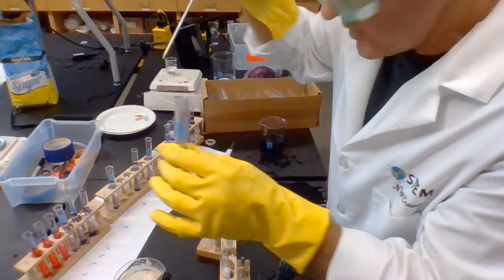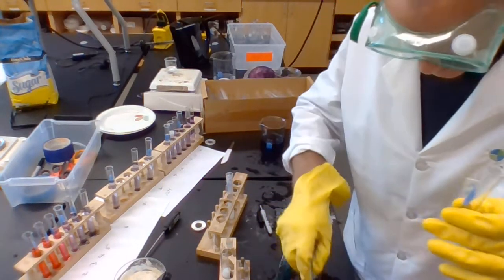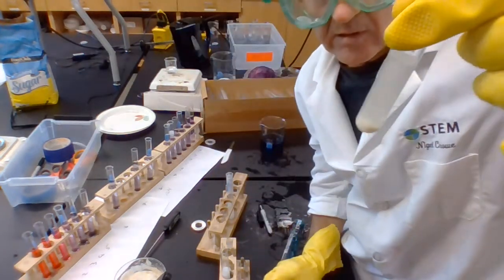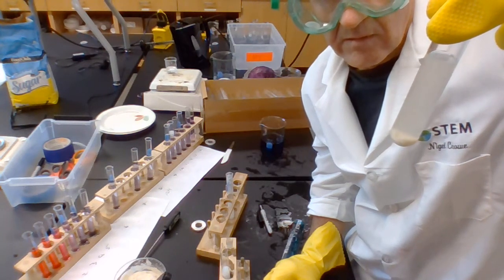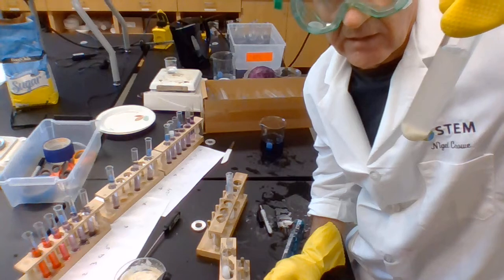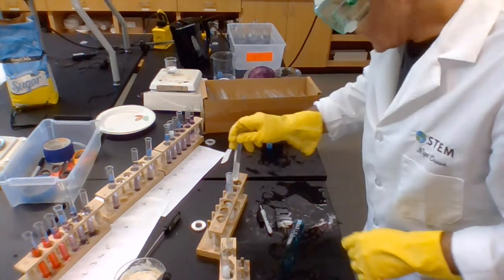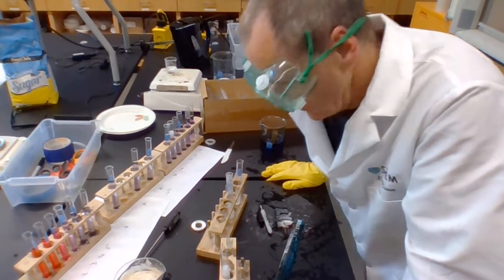No, it's 88.3 or thereabouts. So let's see what this one does when I stick some hydrogen peroxide in. That's the same as before. Absolutely nothing. So, at a high temperature, 88 degrees, it did nothing.